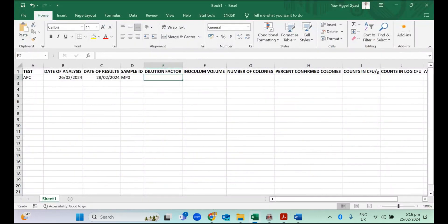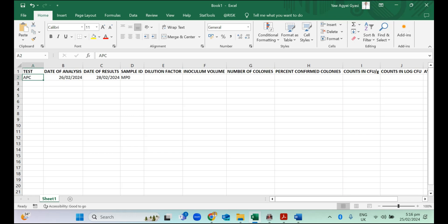We have our test here. That's APC, aerobic plate counts. The date of analysis, supposing the date of our analysis was 26th of February 2024 and then we are using the APHA method. That's 37 degrees for 48 hours. By 28th of February, we have our results.